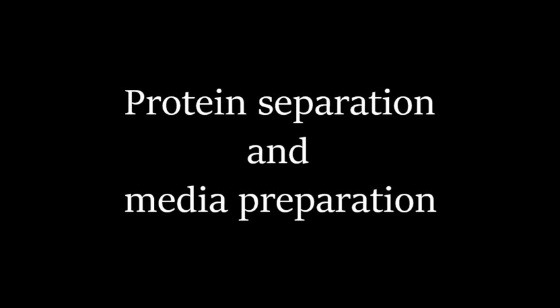Hello and welcome to a preparation tutorial. In this video we are going to show you the steps for media and egg white preparation for lysozyme purification and its analysis.